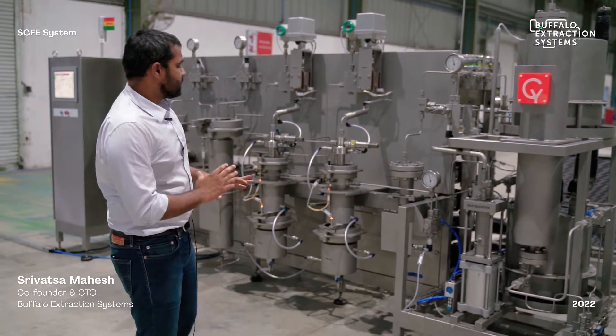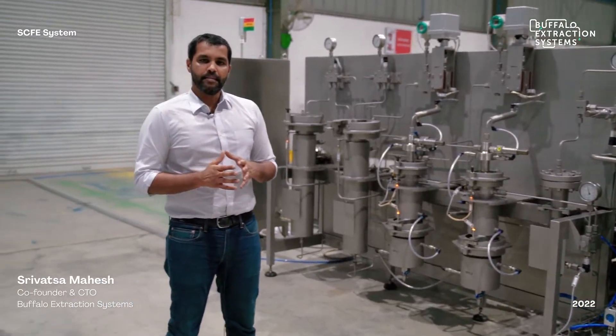All in all, this system enables complete automatic, stable, and robust operation, ensuring continuity and consistency of extraction throughout your production cycle. I hope this has been of help. For more information, please visit www.buffaloextracts.com.